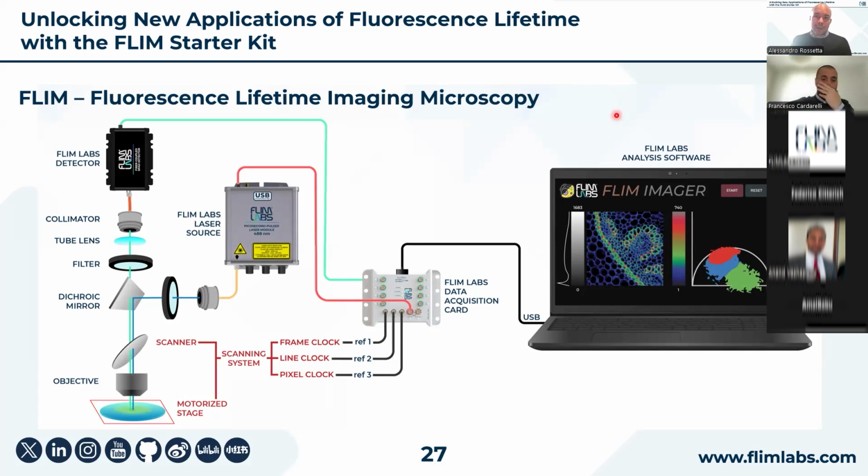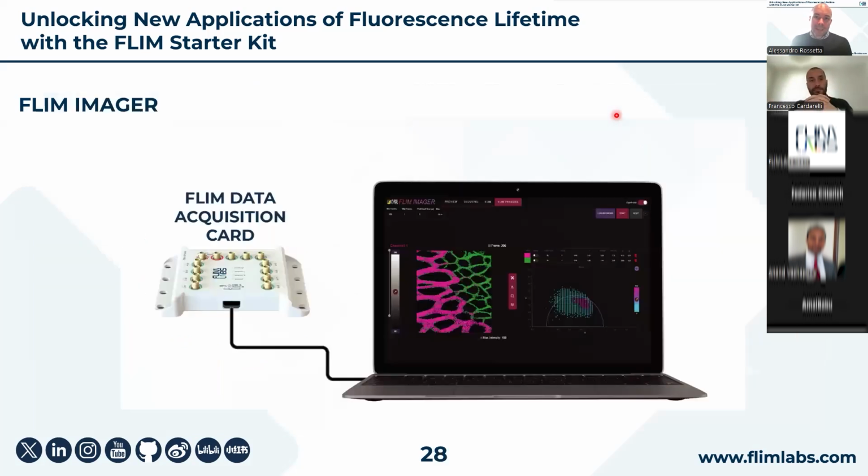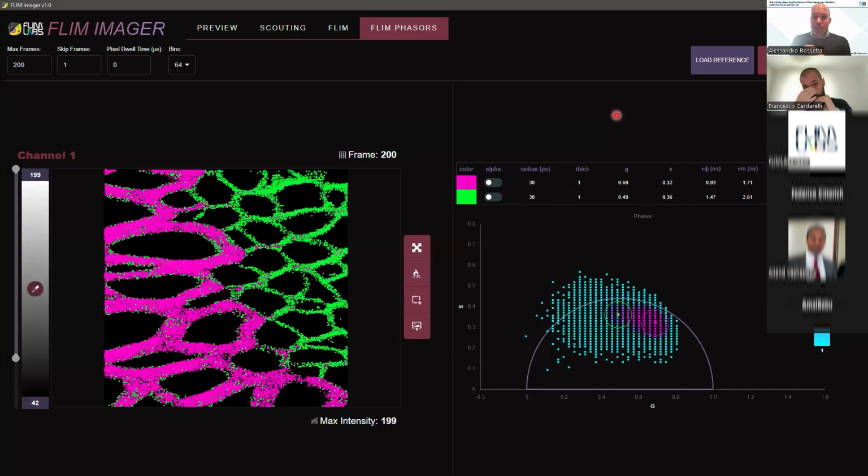Why is that? Because the FLIM card is capable also to be coupled with a dedicated software, which we call FLIM Imager, meant purely for FLIM type of analysis, actually FLIM phasors type of analysis.